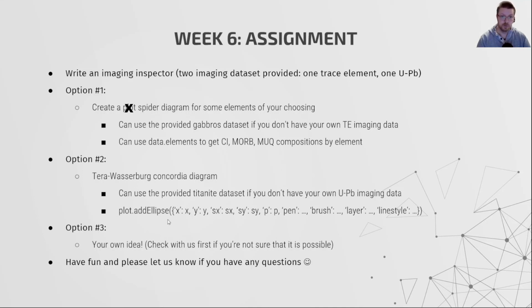If you have any questions about that, please just send us an email or post on the forum. And then, of course, option three is your own idea. And if you're not sure whether or not it's possible, just send us an email first. And that's everything for this week.